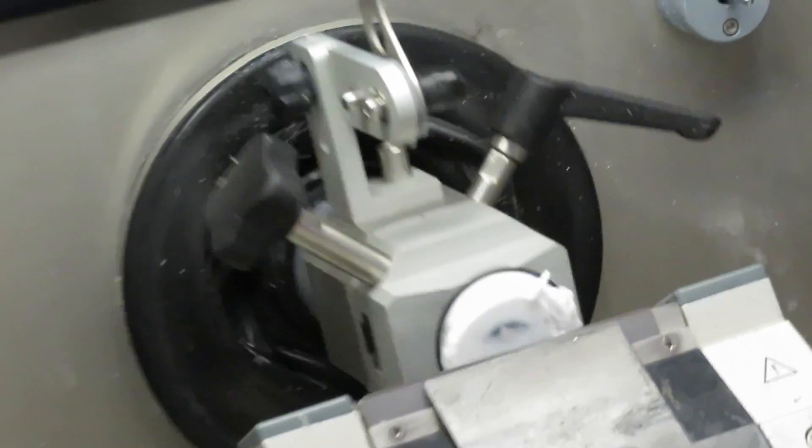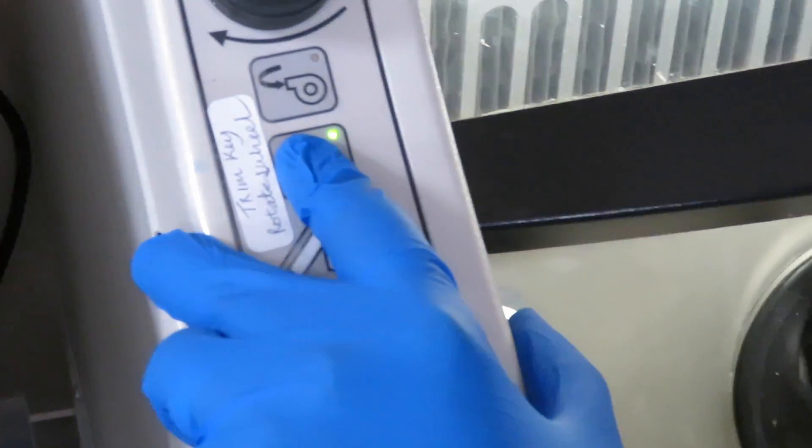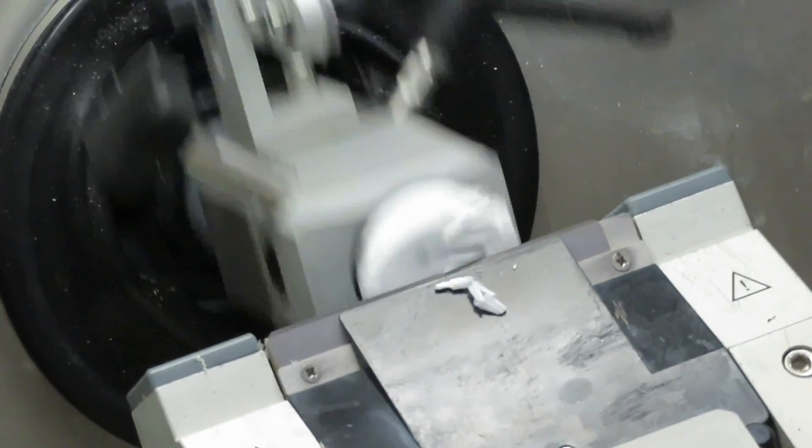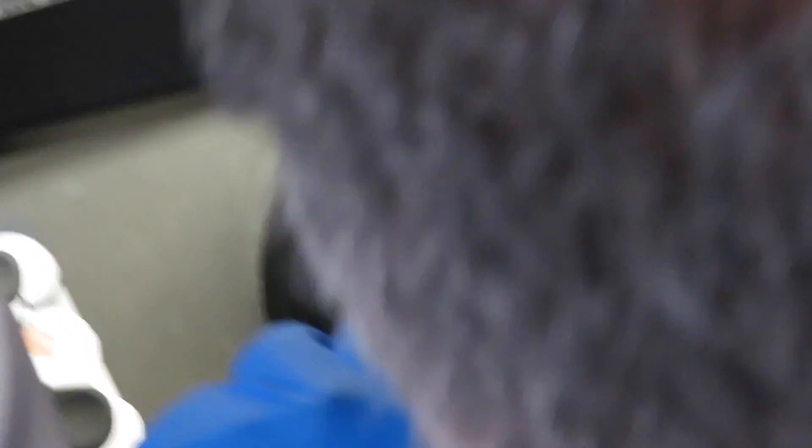This button here controls the platform to make it go back or forward. When he pushes that arrow towards him, it brings the whole platform forward, and that blade, as you can see, will cut it for the full face section.